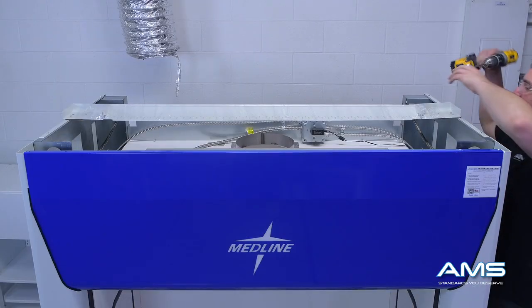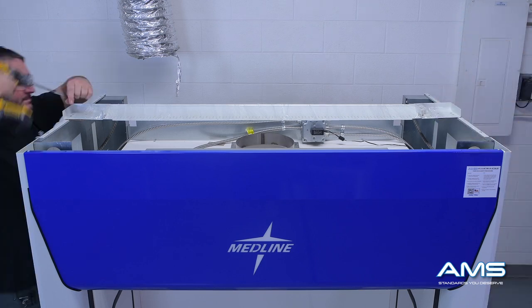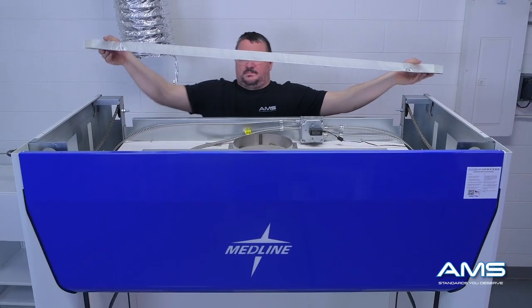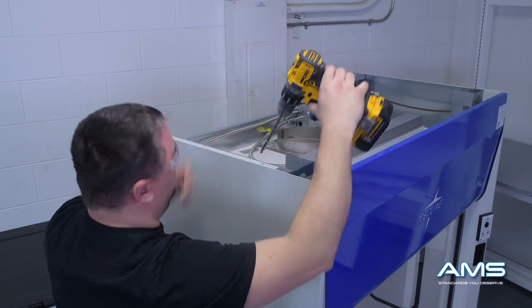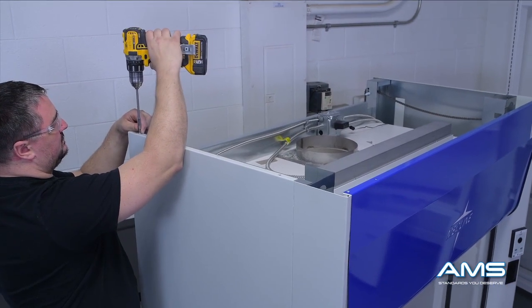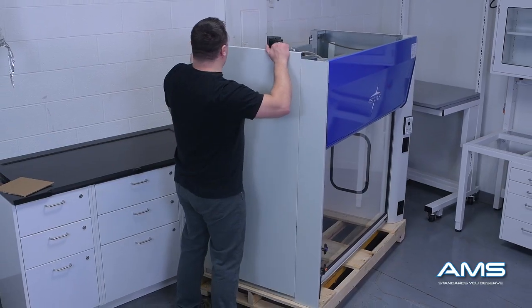The first step in the process is to remove the airfoil. The airfoil is attached by screws that are tapped into the top edges of the side panels. Place the airfoil off to the side and begin to remove the side panels. These are also attached by screws on the top edges — there should be two screws located on each panel. Once the screws are out, the panel is easily removed by lifting up and pulling outwards.